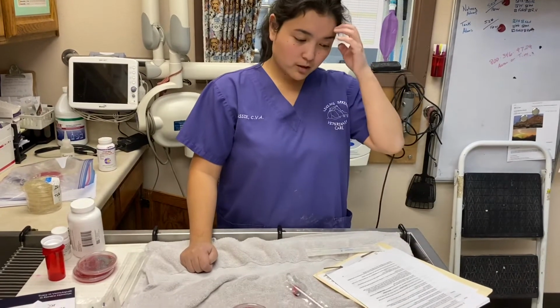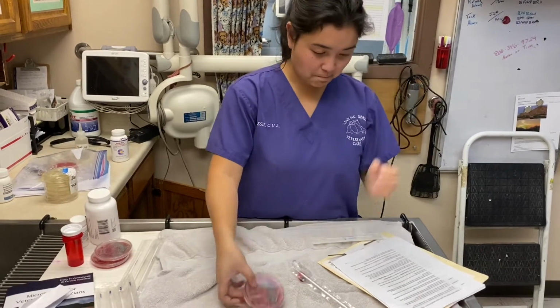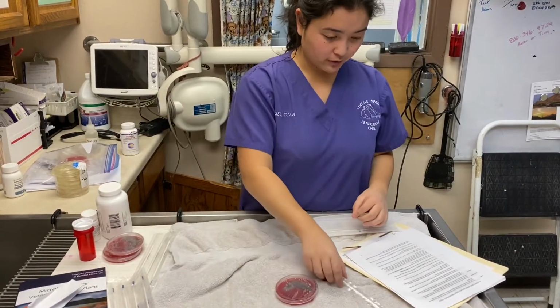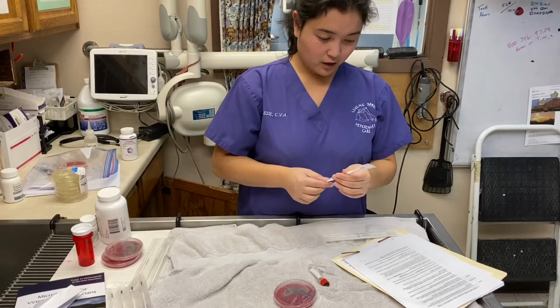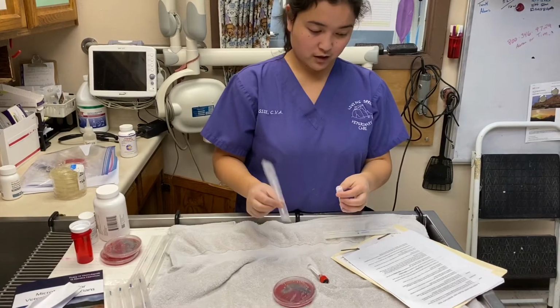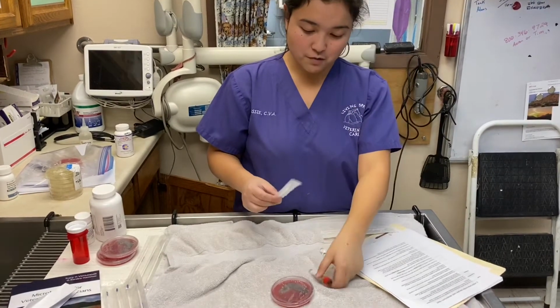Okay, so I'm going to be doing task 5, performing a Kirby-Bauer disc sensitivity test. I have my plate of bacteria that's already grown, and I'm going to transfer about 5 colonies to the tube of sterile saline that I have right here.